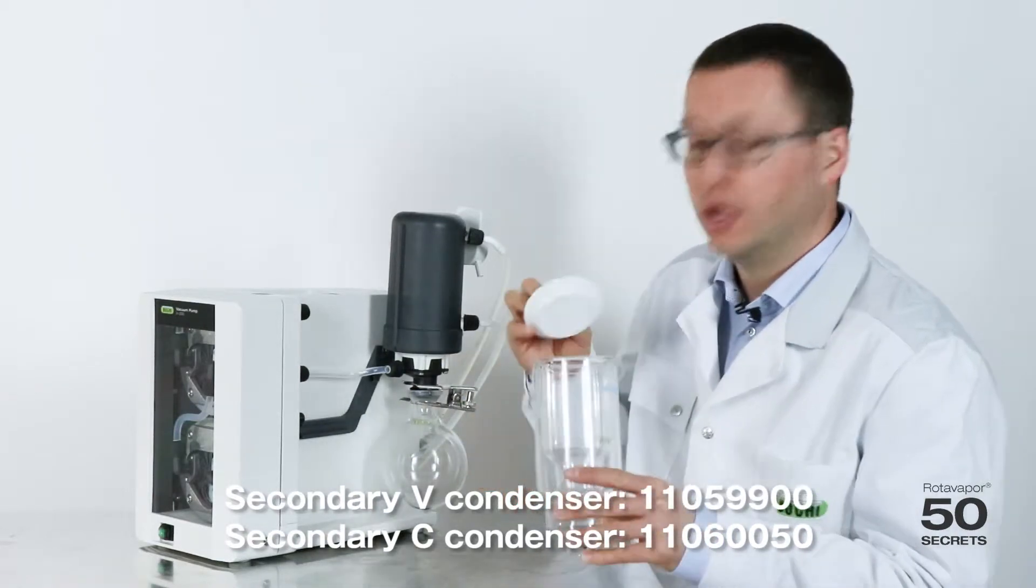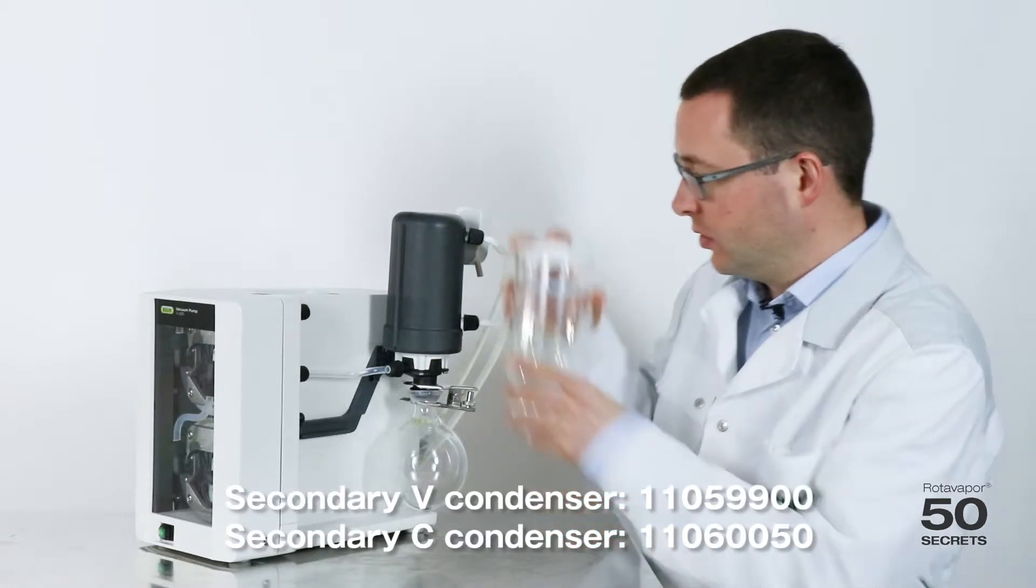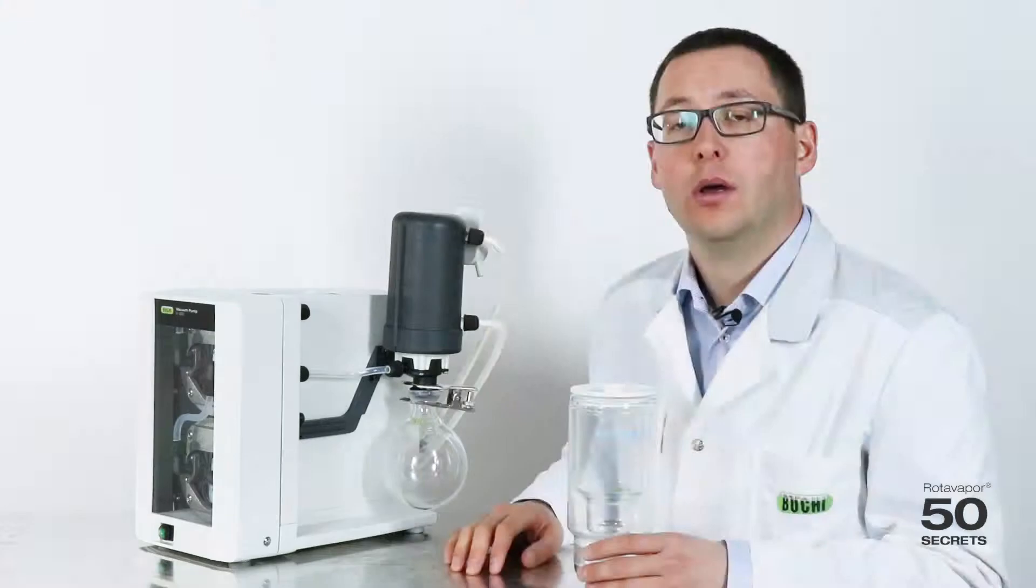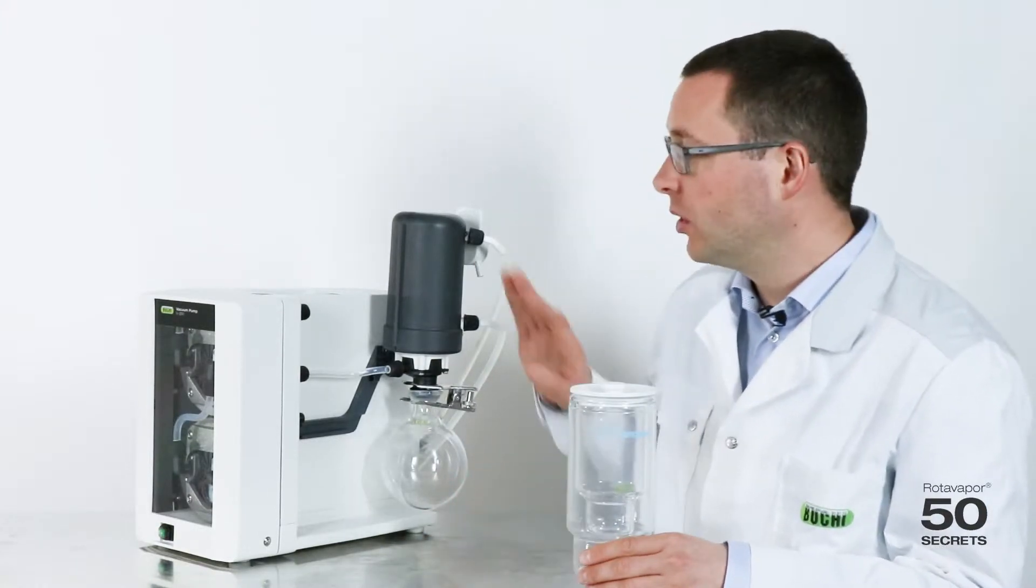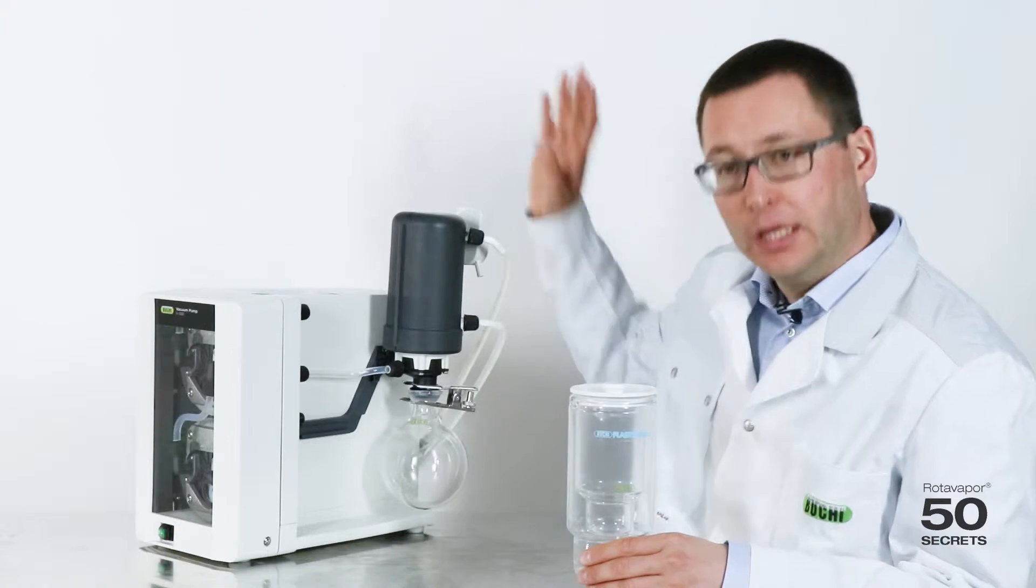We use this for dry ice, for example. It will just be mounted like this over here. Both secondary condensers are there for one reason. We don't want to have emissions into the atmosphere.